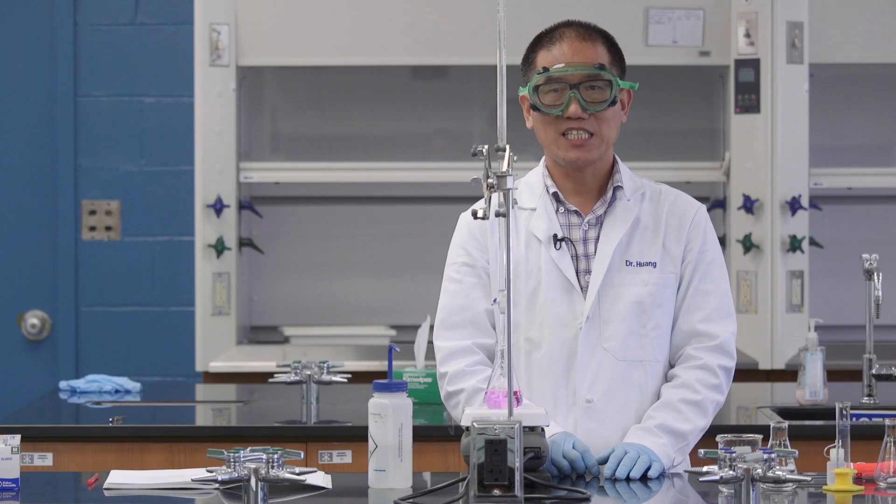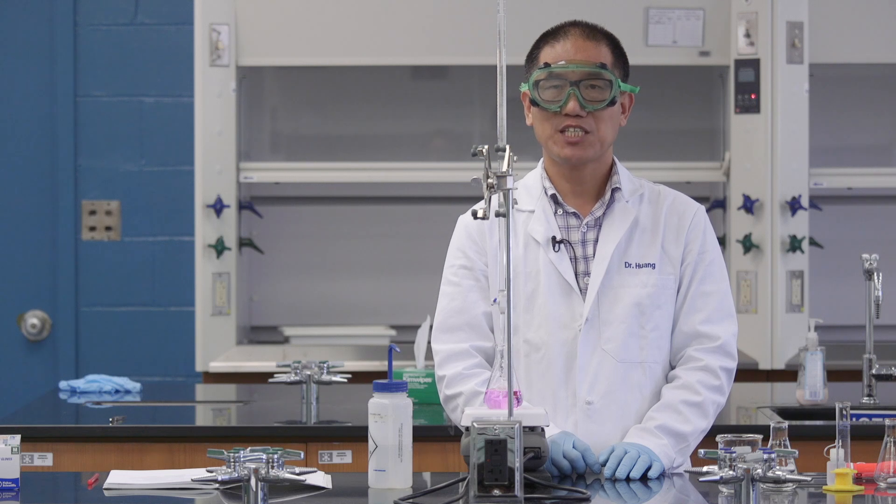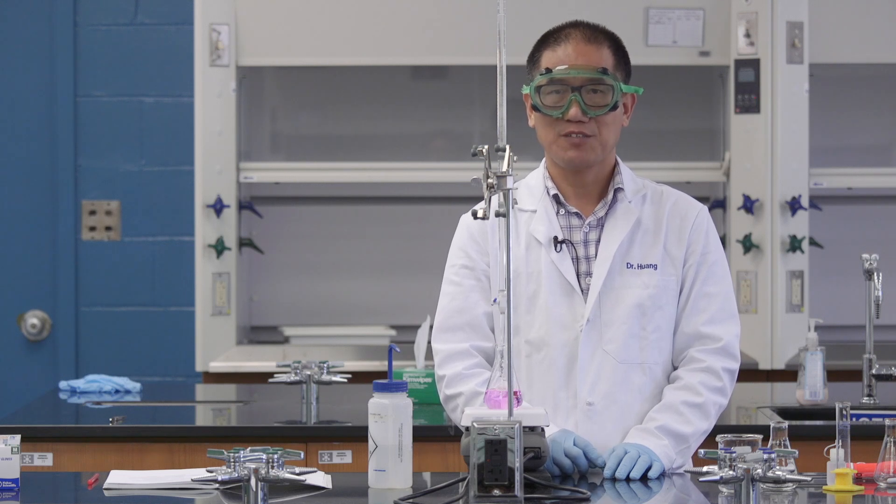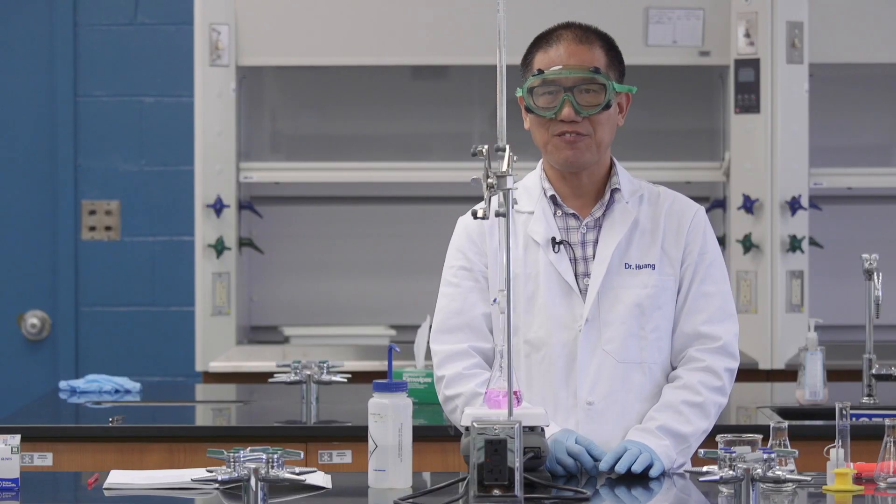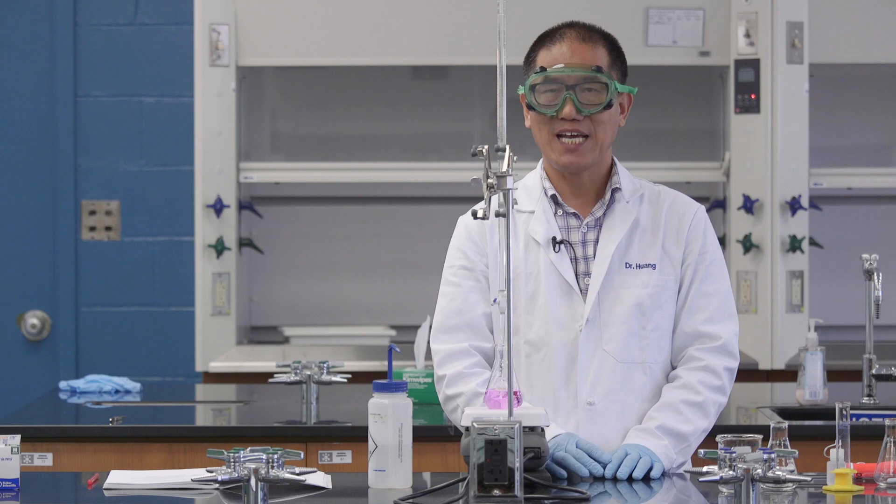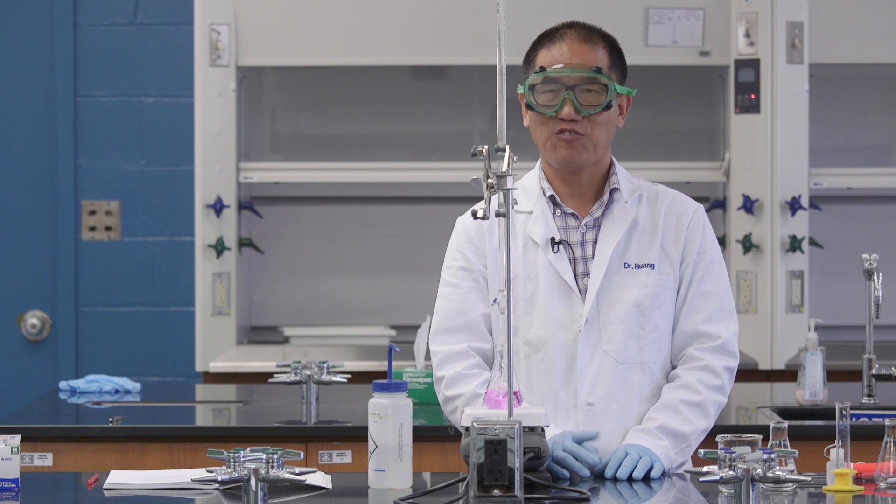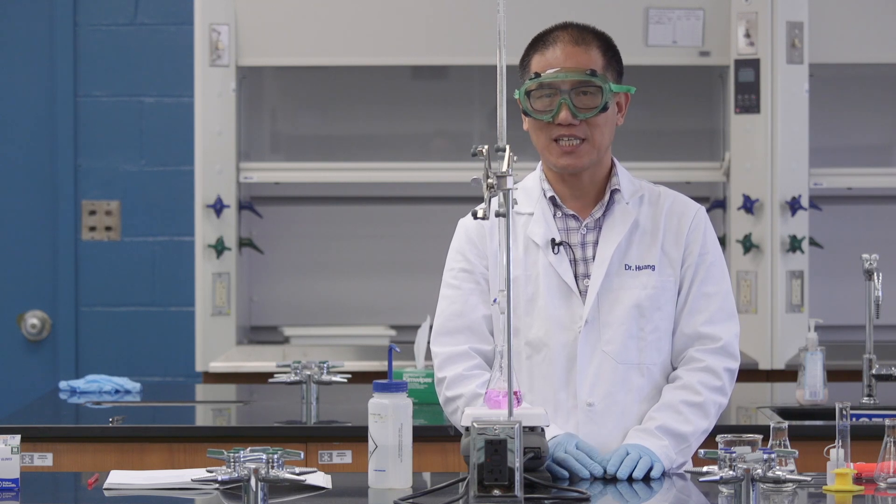For any experiment, including titration, you have to make sure your experimental results is repeatable. In other words, between two trials, the percentage of difference between the two should be less than 0.5% for a professional person to do this titration.